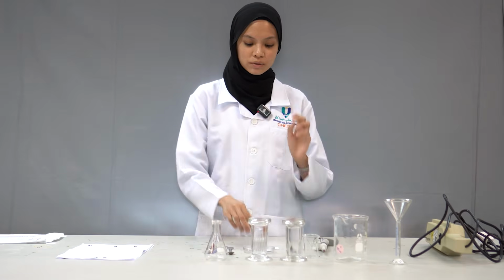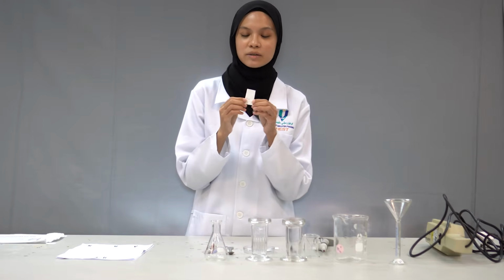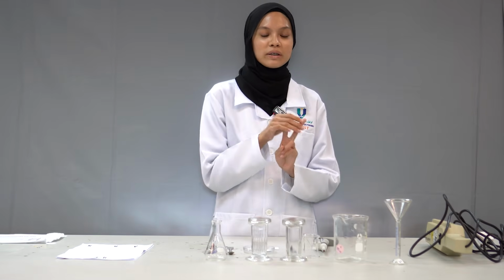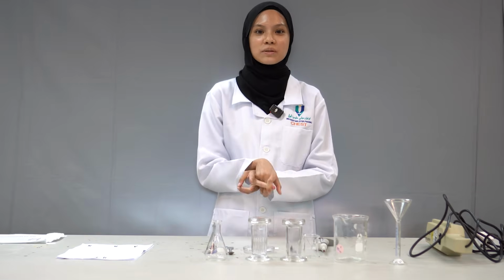The compounds will be separated by two different phases. The first one is the stationary phase, which is the thin layer plate, and the mobile phase, which is the solvent system. The solvents we are using are two different mixtures. The first is a mixture of hexane and ethanol, and the other is DCM, which is dichloromethane, and hexane.